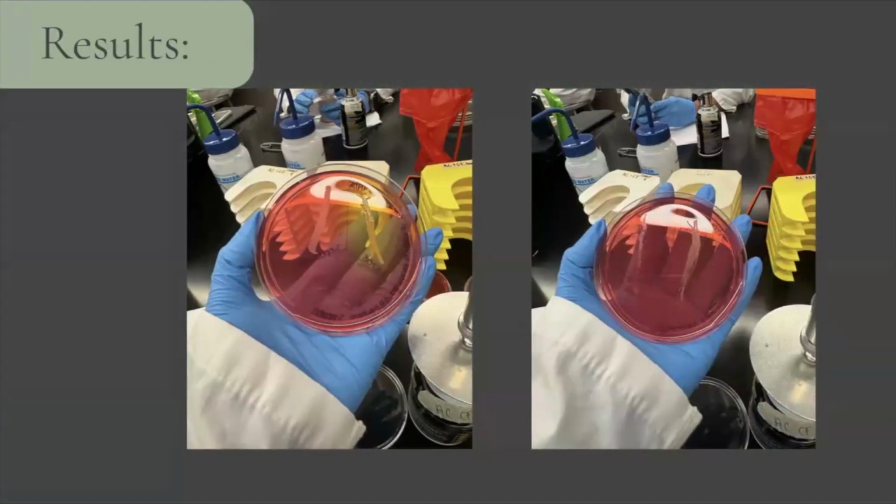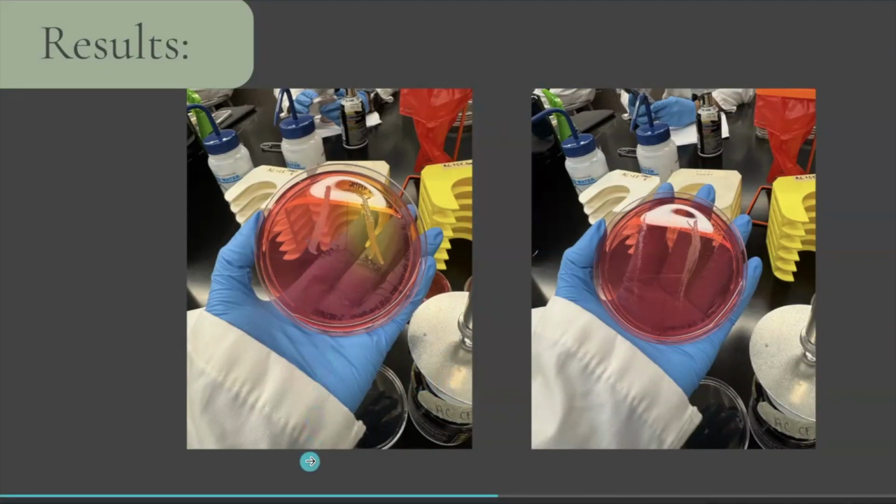For the mannitol agar on S. aureus, we see growth and a yellow medium, or yellow precipitate around it, and this just means that it ferments mannitol. And S. epidermidis on this side, we see growth but no fermentation, but we do see a pink-red precipitate around it. And for S. pyogenes, we don't see any growth. This could be because it's sensitive to salt. And for unknown 114, we see growth with a slight yellow tint when it's in the light. This could be human error, or it does ferment mannitol and the light is kind of tricking us. But the unknown 294 has no growth.